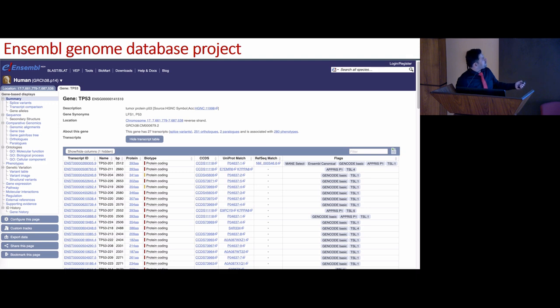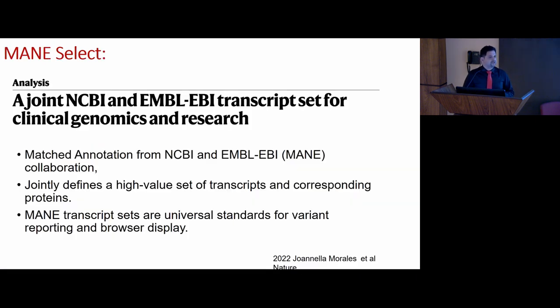So I went to gene allele. What you can see is that the minute I type TP53, I get so many different transcripts. So it says that yes, TP53 is here and there are a number of transcripts of TP53 which are active. It is a lot of craziness, because you all know about mutations, right? We say IDH1 R132C, or we say IDH2 R140Q. But what does that mean? It is with reference to one particular transcript, and what one transcript says in one lab may not mean the same as in another lab.